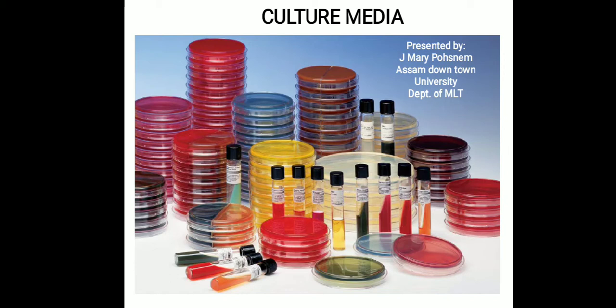In the case of water, it will provide a source of hydrogen and oxygen, and electrolytes like sodium chloride and others. Then peptone is a complex mixture of partially digested proteins. It is obtained from lean meat or other protein materials such as heart muscle, casein or fibrin, usually by digestion with proteolytic enzymes. Then we have the meat extract, which contains protein degradation products, inorganic salts, carbohydrates and growth factors.